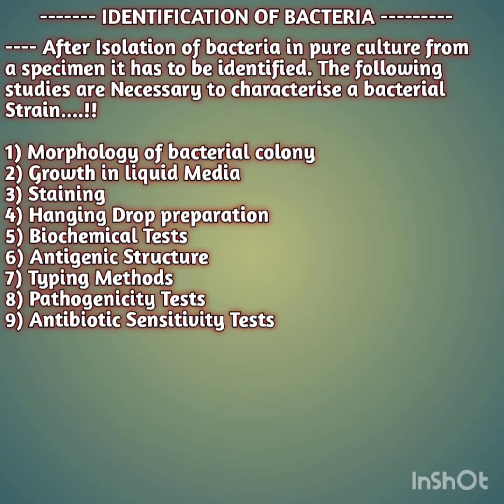After isolation of bacteria in pure culture from a specimen, it has to be identified. As you all know, our previous vlog was on media cultures and culture methods. So we will identify the bacteria from a pure culture. Why will we identify? Because we need to know which bacteria it is.